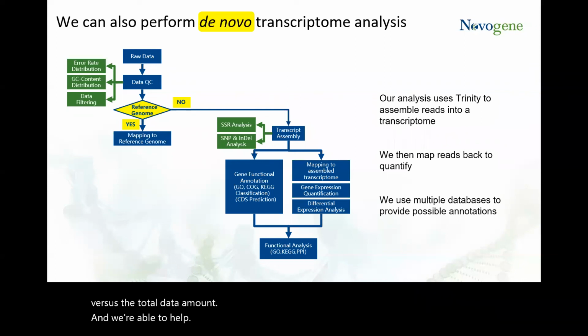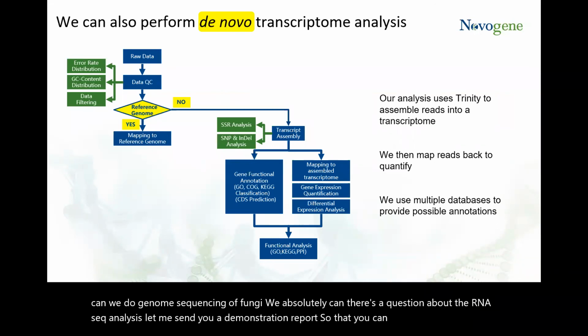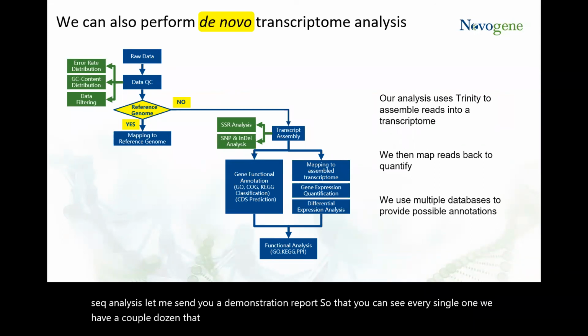All right, let's see. I think I have 1 or 2 more questions here before we run out of time. One, can we do genome sequencing of fungi? We absolutely can. There's a question about the RNA-Seq analyses. Let me send you a demonstration report so that you can see every single one. We have a couple dozen that we use.